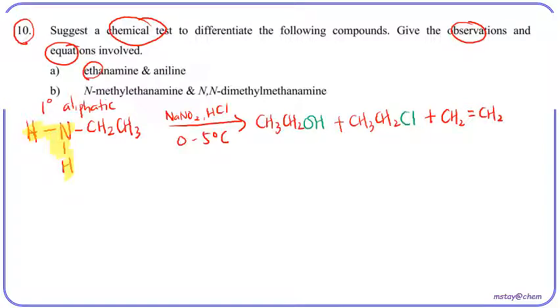We still remember that the primary aliphatic amine will give off nitrogen gas, and the observation for this reaction will be bubble gas released.